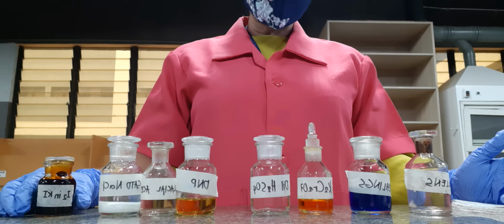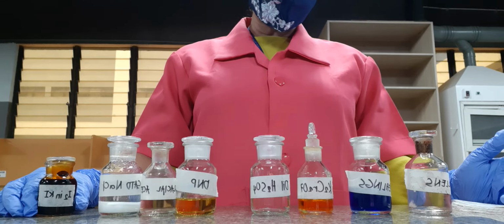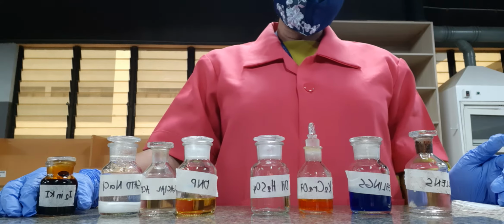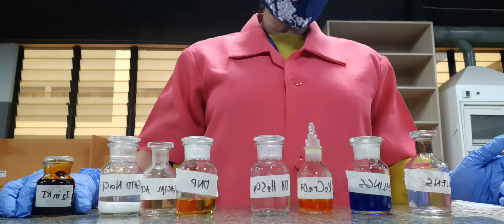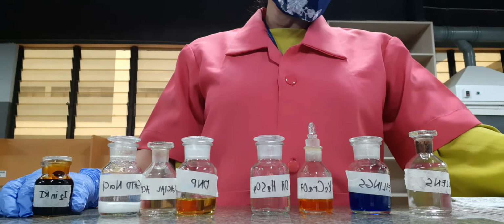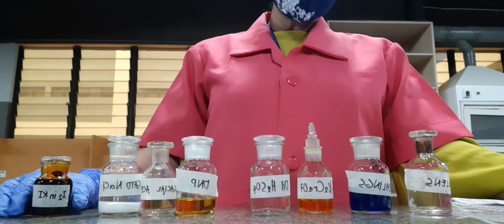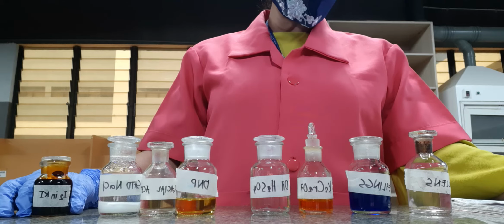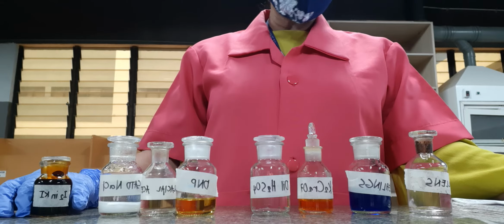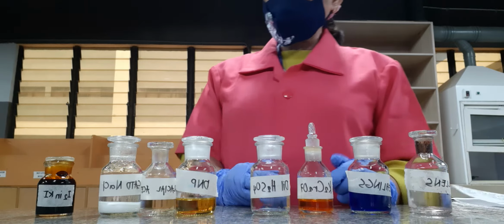Now we will be repeating some of this because with our primary alcohol, we normally see a reaction between ethanol and an oxidizing agent, which is potassium dichromate. So we expect that it will also result in the same reaction.